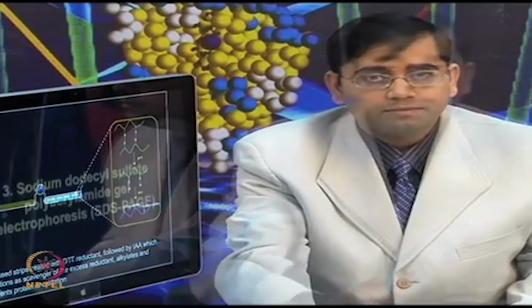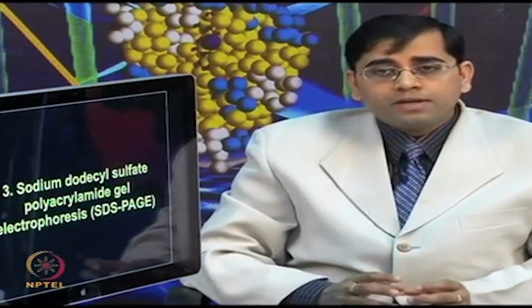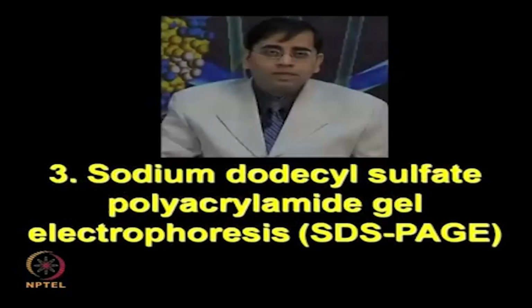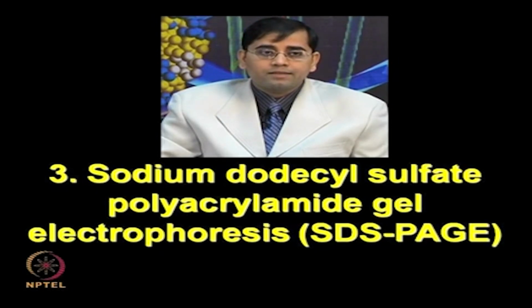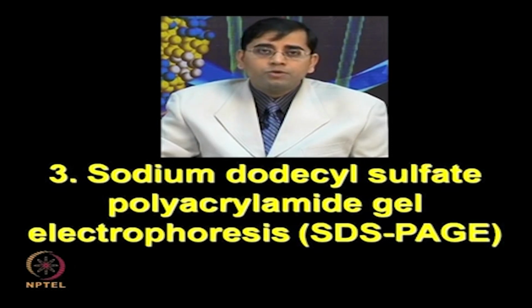these residues. Okay, after having discussed the equilibration step, now we can talk about how to perform sodium dodecyl sulfate polyacrylamide gel electrophoresis or SDS page. As I mentioned, when you perform SDS page alone for separating your regular protein extract, then you need to add both stacking and resolving gel.